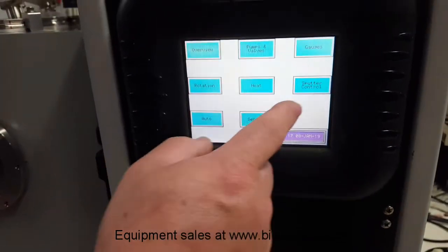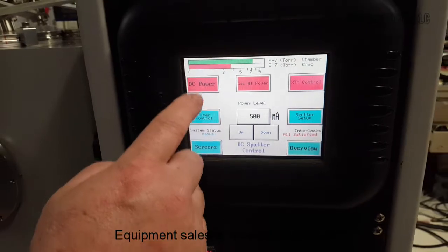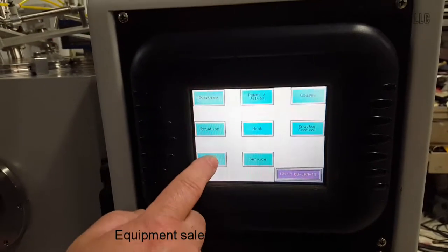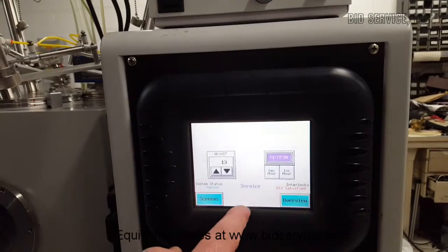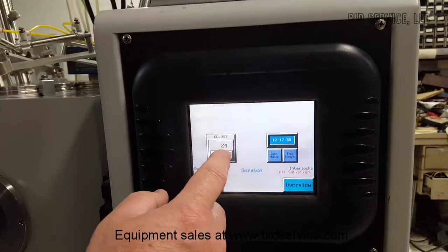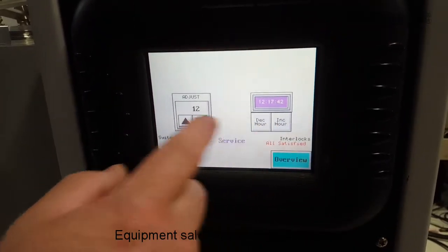This other screen is sputter control, which I will get back to — I'll show you how to do sputter on this thing. Auto will tell you if you want to auto pump down or auto vent. And the last one is your service screen, where you can change your contrast and also set the time.